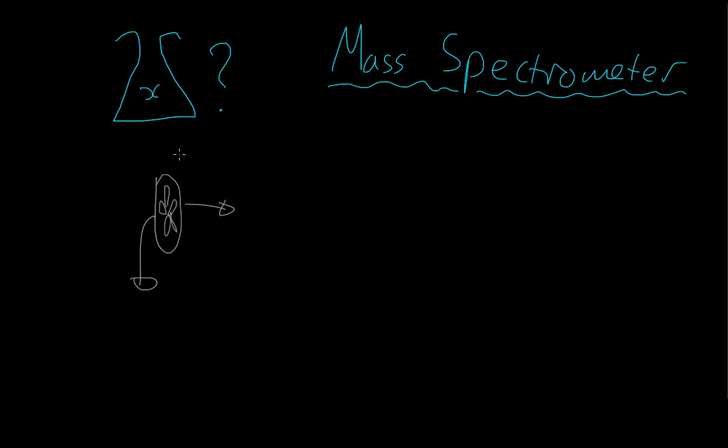Now, we have a target on the other side of the wall. And let's draw some blue on there to make it appealing. So we have a tennis ball, and we want to throw this tennis ball at the target. Now, if we throw it hard enough, it will just go and hit the target, providing we have good enough aim. But then if we do the same with a ping pong ball, that's a bit big for a ping pong ball, but just assume it's a big ping pong ball, and we throw that at the target, we'll see that it'll get blown away.